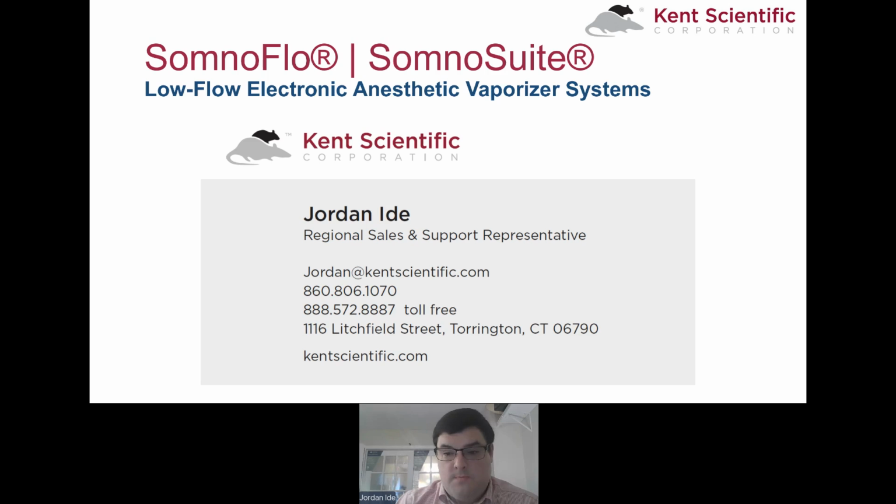Fantastic. That's great. Can you explain general maintenance required for replacing the hoses, other minor parts of the system? Sure. So the main maintenance points we find are there's a small tube on the front of the Somno Suite that runs from the syringe to the black vaporizer block. You want to make sure that does not get kinked or wound up, because after a lot of use, if it gets too kinked, it will start to leak, which then would require replacement. But it's very easy to not kink up.